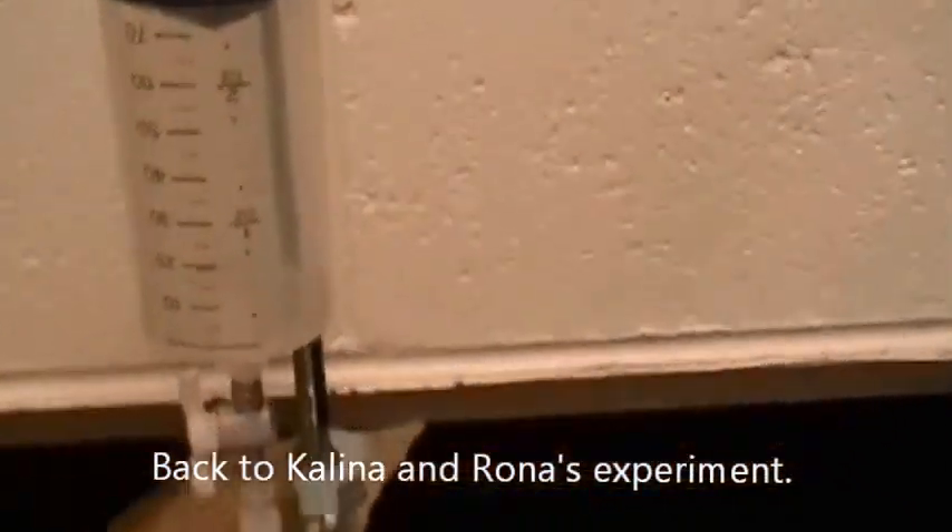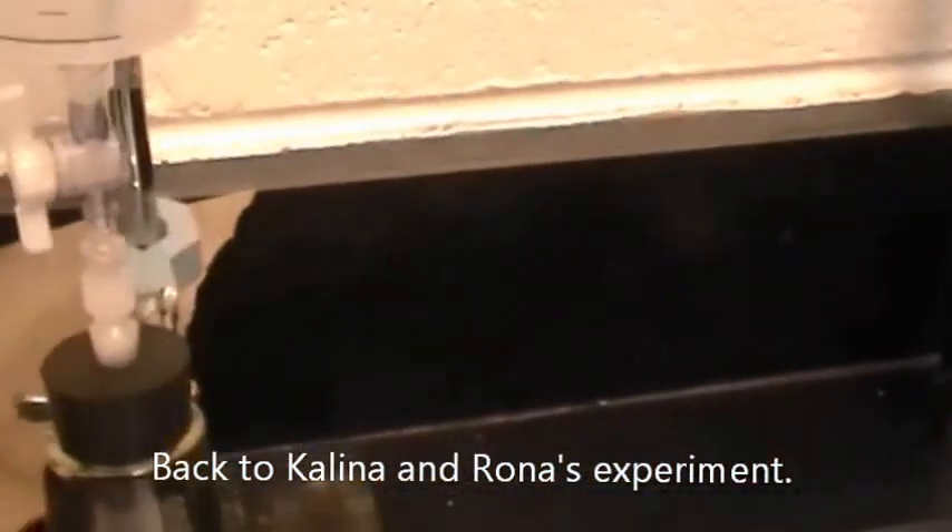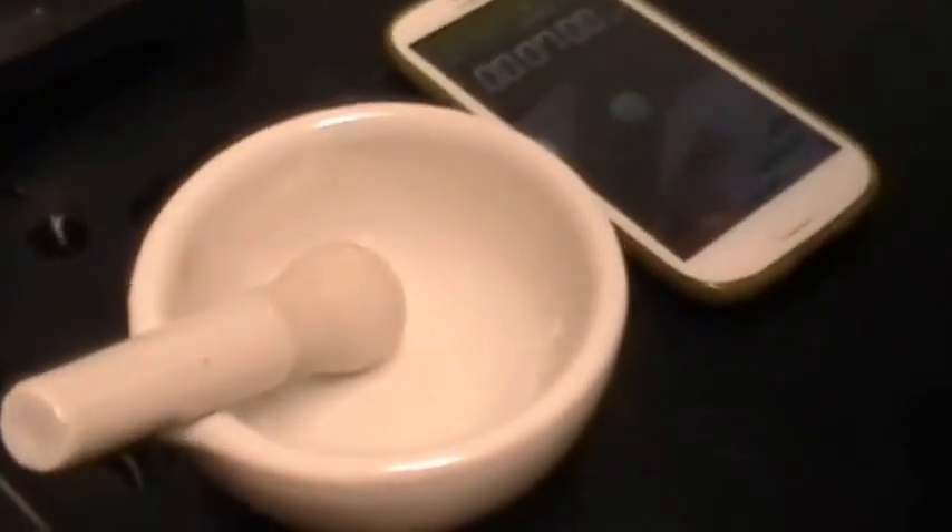Here we have our 2 molar HCl with 0.52 grams of calcium carbonate, currently at the 13th minute with 75 milliliters of CO₂. And here we have 4 molar HCl with 0.53 grams of calcium carbonate — crushed — on the 7th minute at 42 milliliters. The volume is going up very slowly and tending to be steady rather than a steady incline — same reading each time. We'll have to see what's going on.